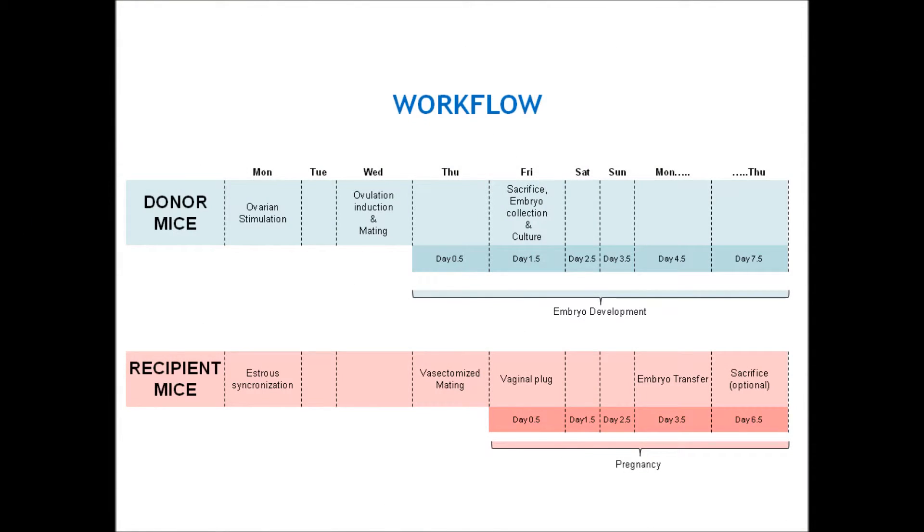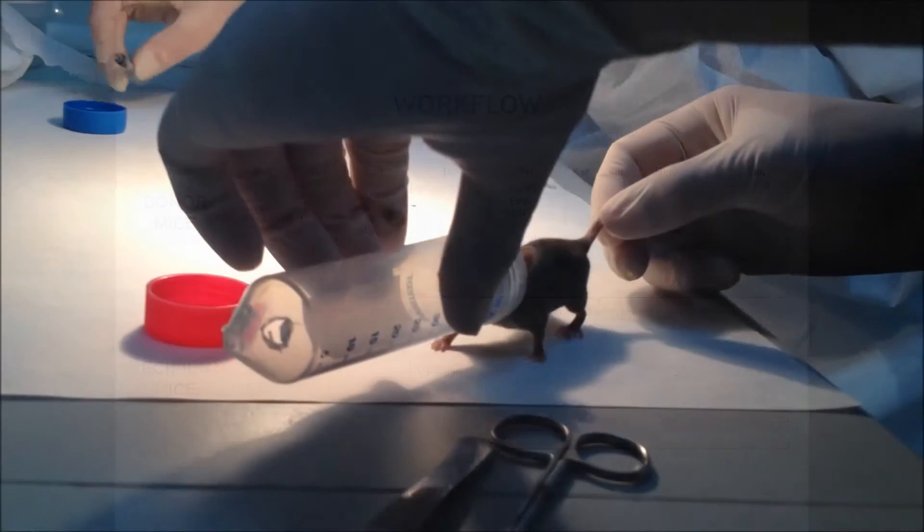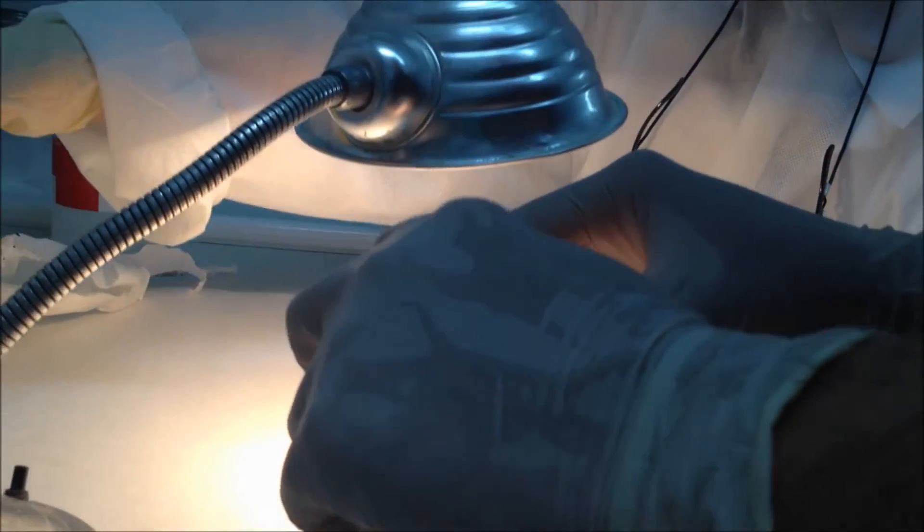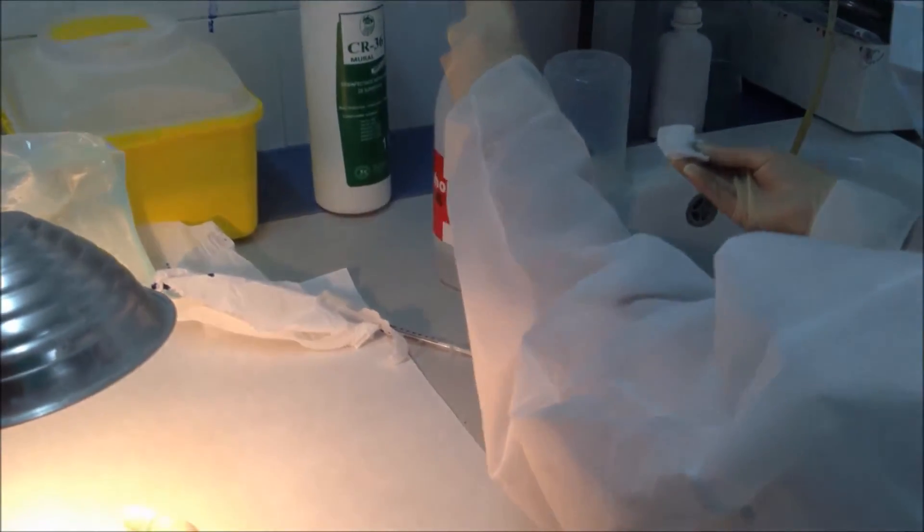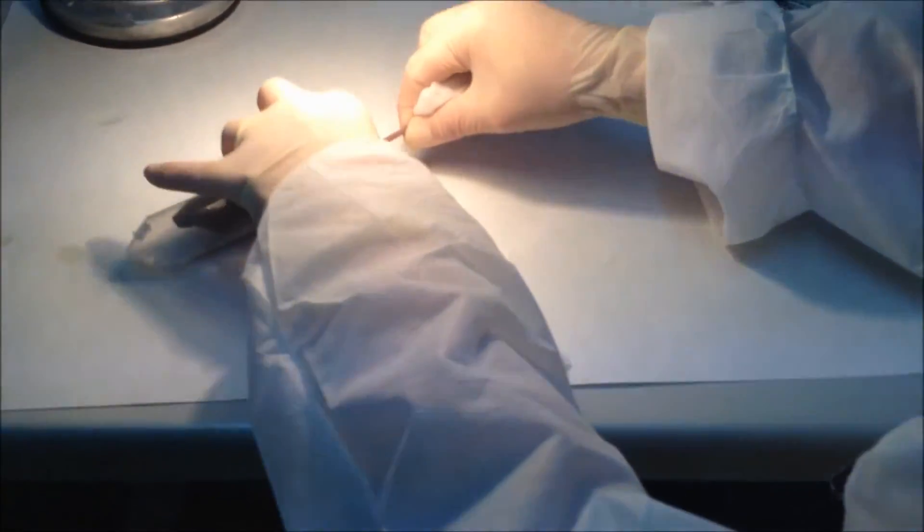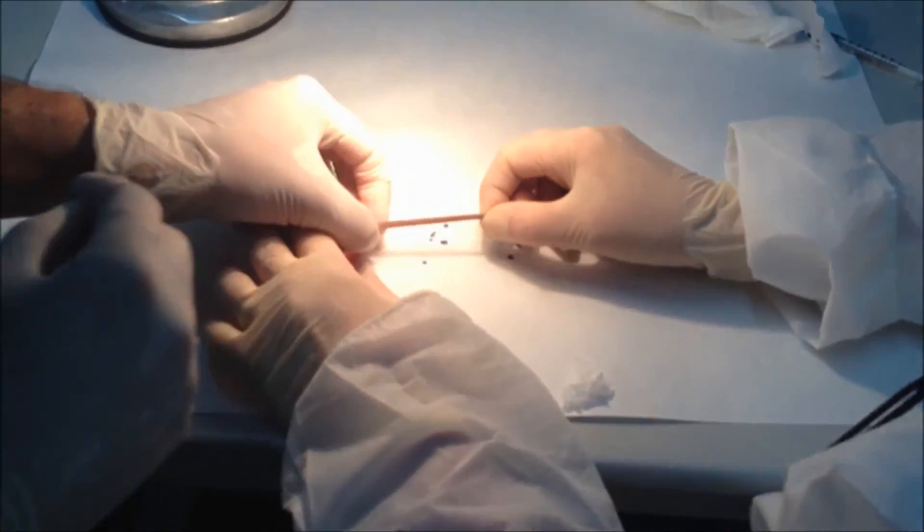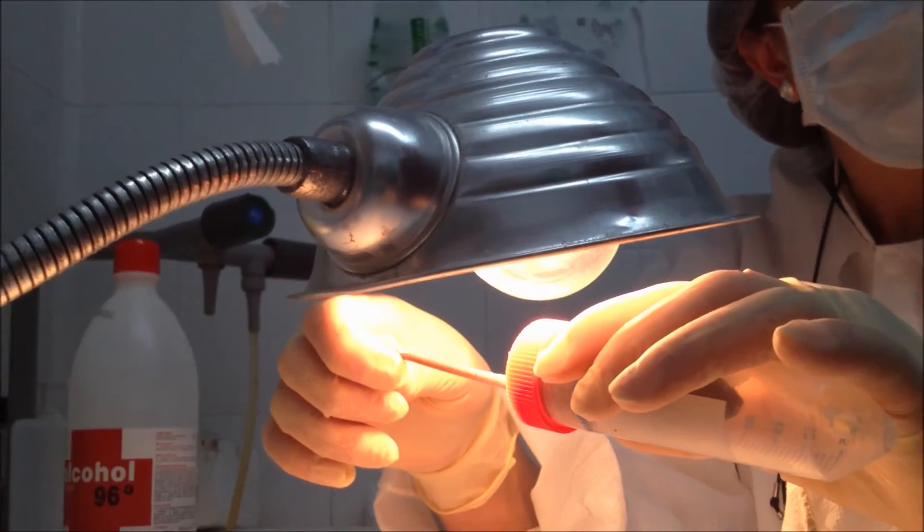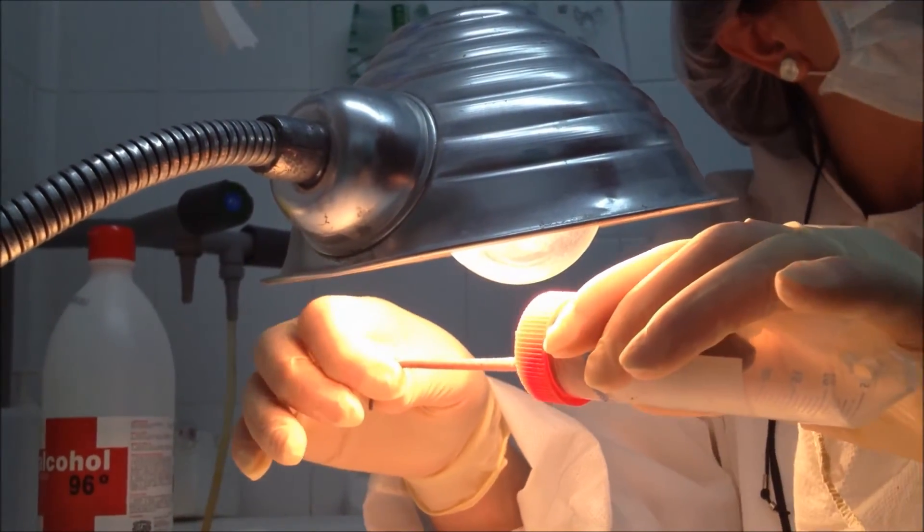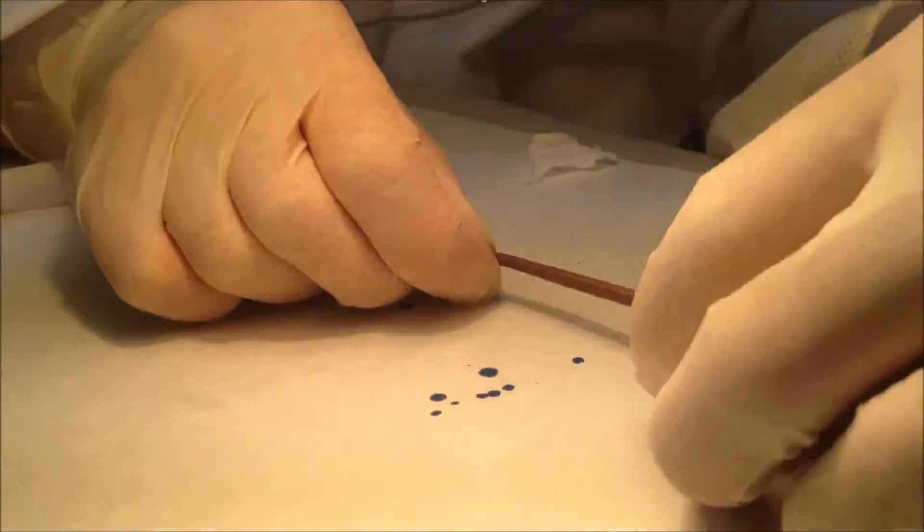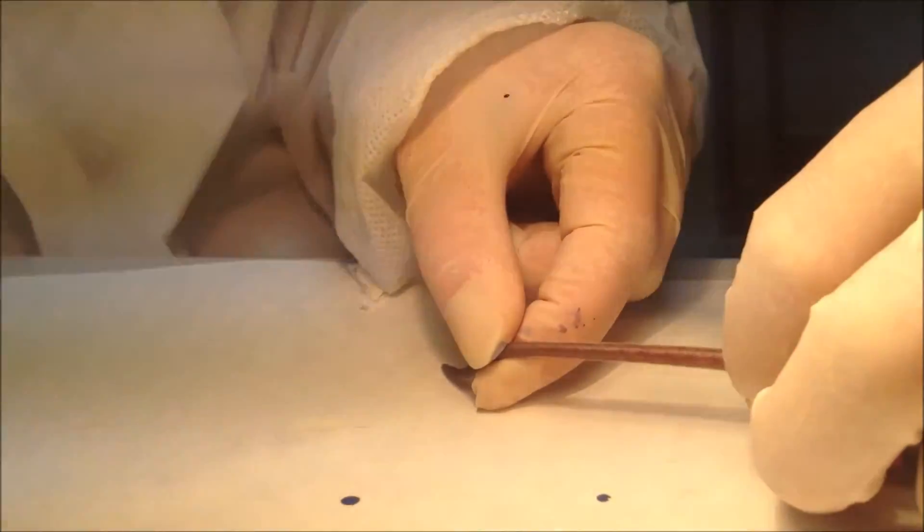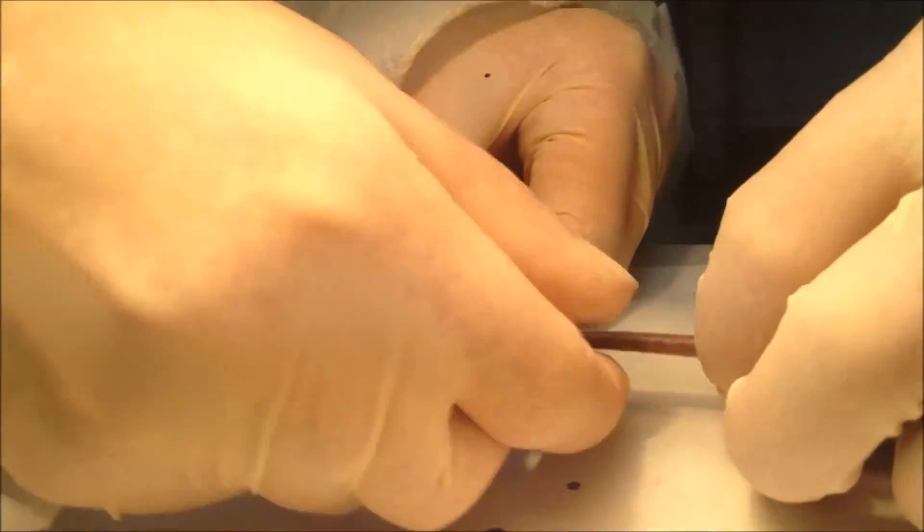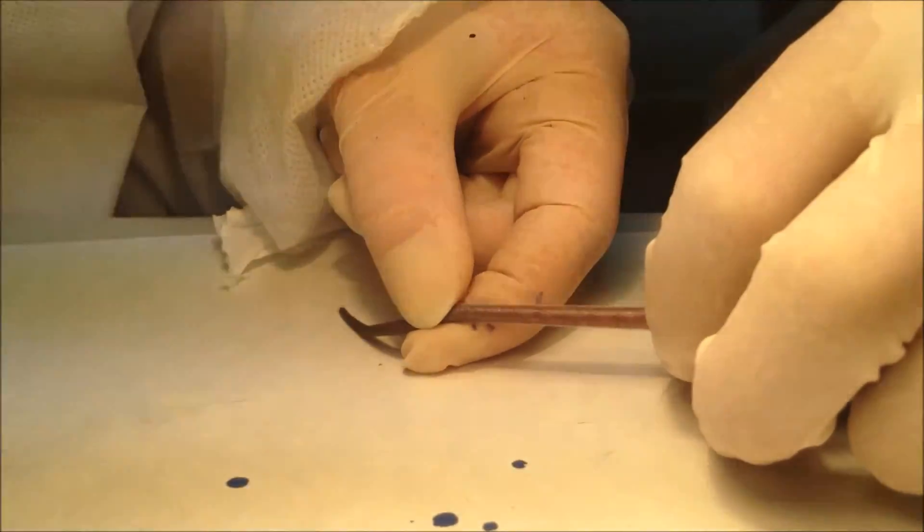First, inject 1% of Chicago Sky Blue 6B reagent into the tail vein. To better visualize the vein, carefully warm the mouse tail using a lamp. Inject 100 microliters of the Chicago Sky Blue 6B reagent.